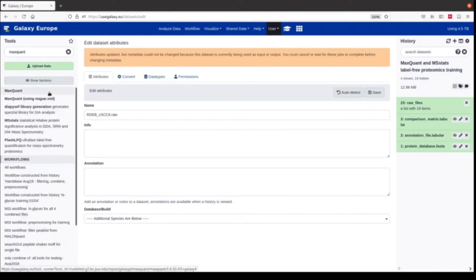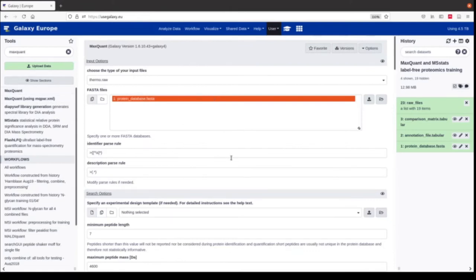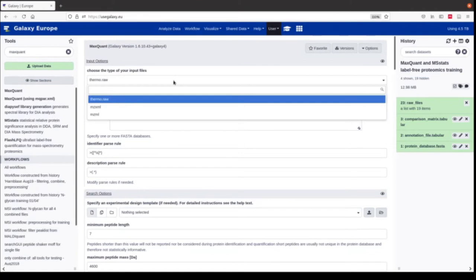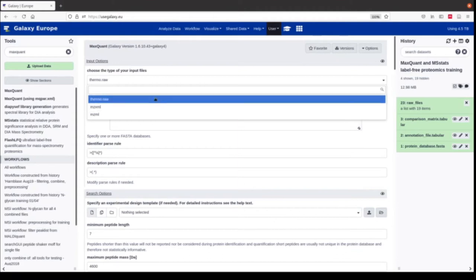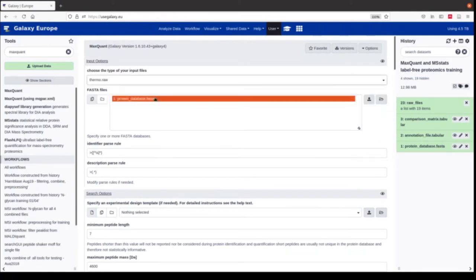Now we start with the first tool: MaxQuant. There are two versions of MaxQuant — one where you can only specify parameters in a MaxQuant MQPAR file, and this version where we can set parameters in a graphical user interface. We have to choose which format our raw files have — thermo.raw is already selected. It would also be possible to do the analysis on open standard formats like mzXML and mzML, however they have to follow a very specific format to be compatible with MaxQuant. First we select the FASTA file — that's already done for us.